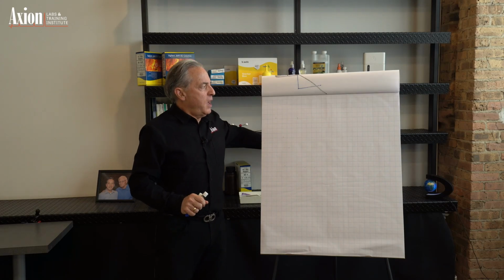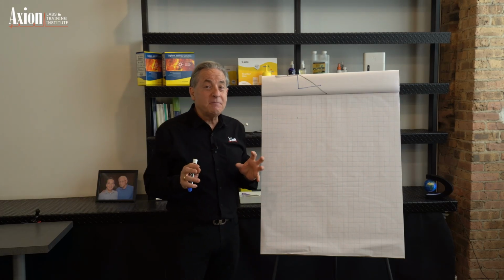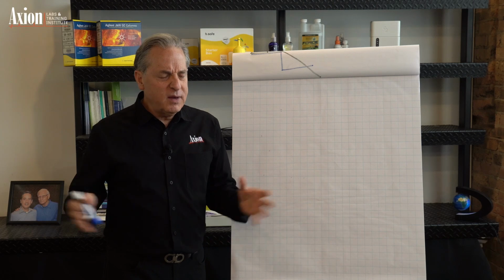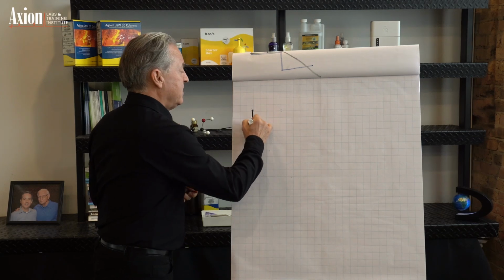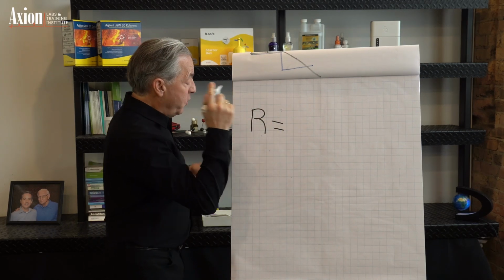Now, I'm a practical chromatographer. I'm not a theoretician. I'm not big into equations, but this is something that is going to make your life easier if you understand it. So the resolution equation: every LC, GC, SFC, any kind of chromatography in the world follows this equation, and that is, in order to get resolution, and that's our goal, to separate peaks, we have three things.